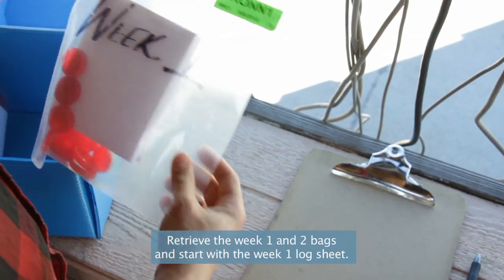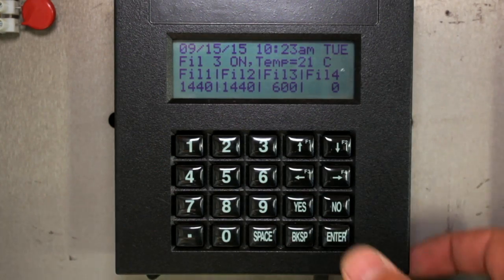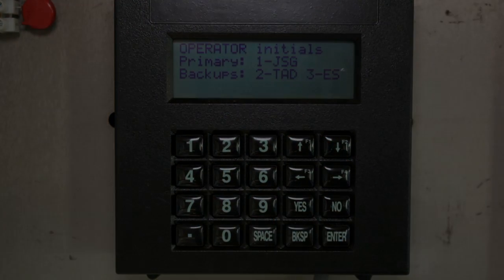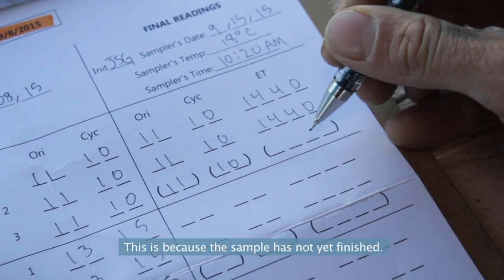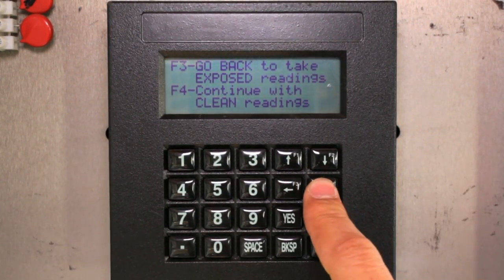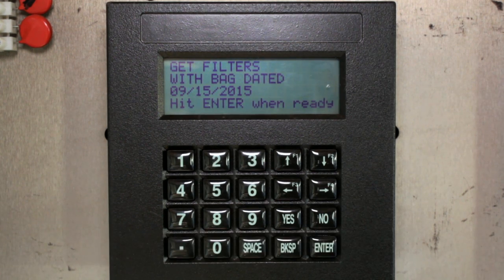Retrieve the week 1 and 2 bags and start with the week 1 log sheet. Perform final readings as usual. However, position 3 values will have parentheses around them on the log sheet. This is because the sample has not yet finished. After recording all final readings for the week 1 log sheet, the controller will prompt you to install the filter bag with this week's Tuesday date.